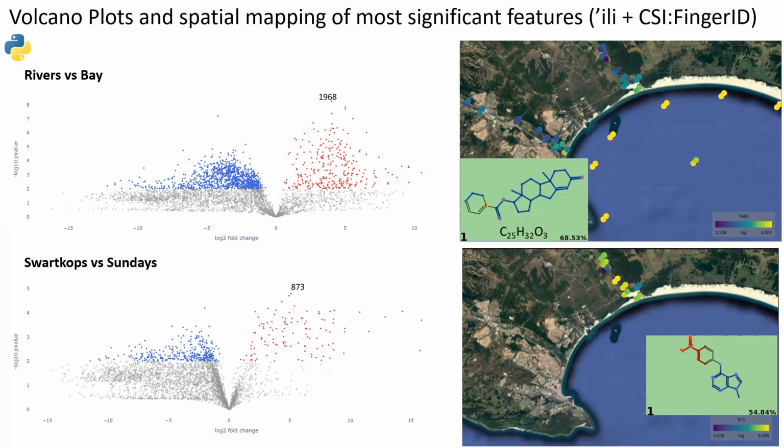It's basically trained a machine learning model on ionization efficiency data for various, like thousands, 100,000, I don't know exactly how many compounds, but many.